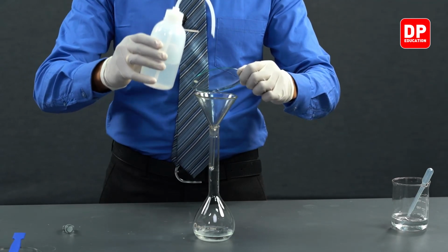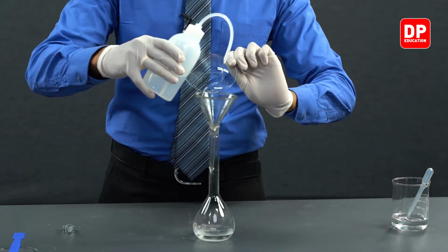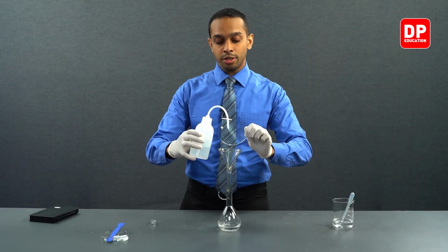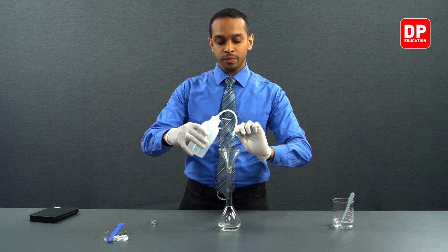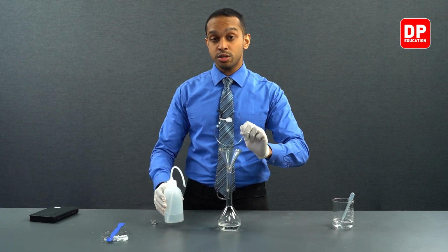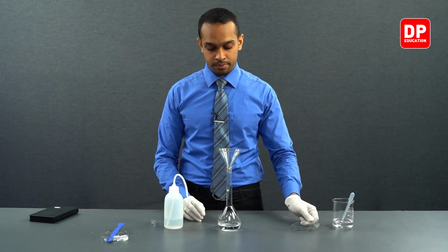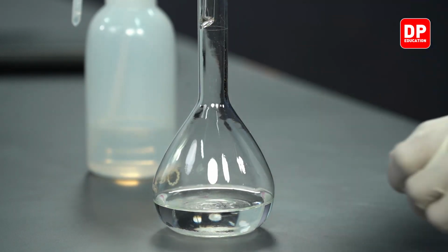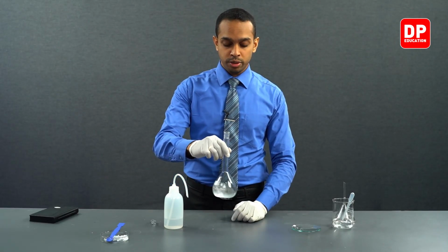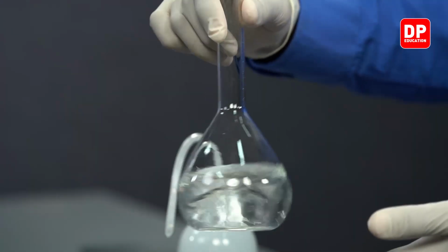After you wash one side of the watch glass, you have to turn it around and wash the underside of the watch glass. Otherwise, there could be some residual amounts of solid remaining there. So once you do this, all of the solid would be washed and transferred onto our volumetric flask. Let's move on and swirl this volumetric flask around. Try to dissolve all of the solid that we have here before we add more water onto it.